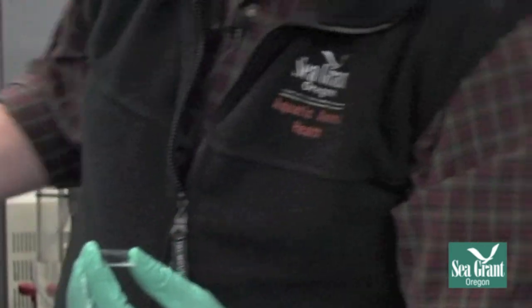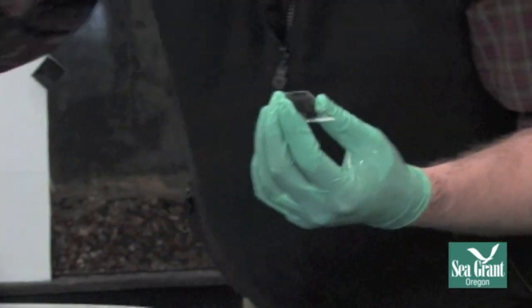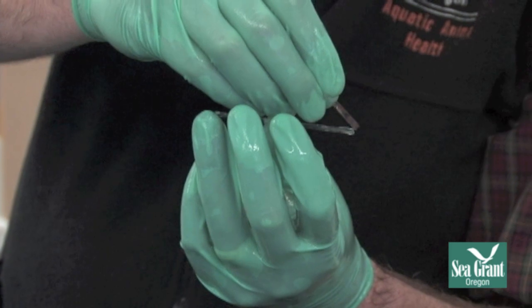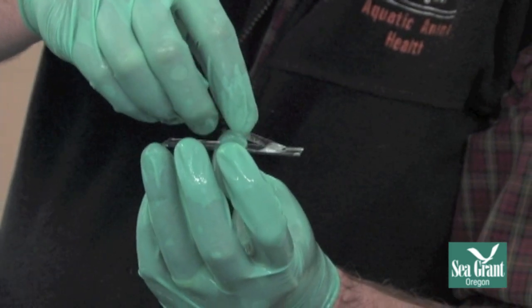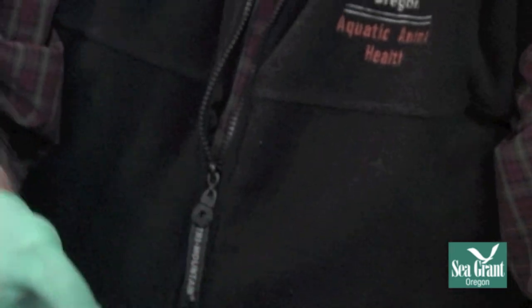You can see you get a fair amount of mucus. Then we just take a drop of water from the tank or pond the fish came out of, and take a cover slip and pull that mucus back into the drop of water, then just drop it straight down. It spreads out nicely, and then we go look at that under the microscope.